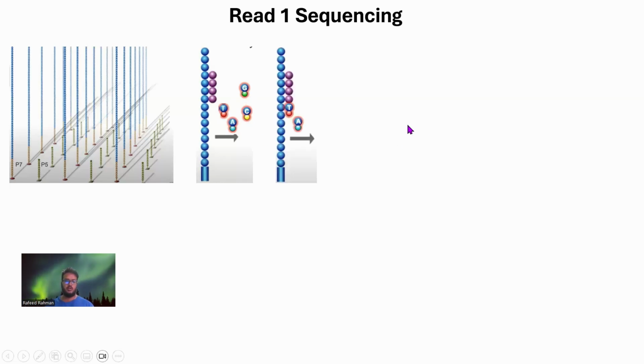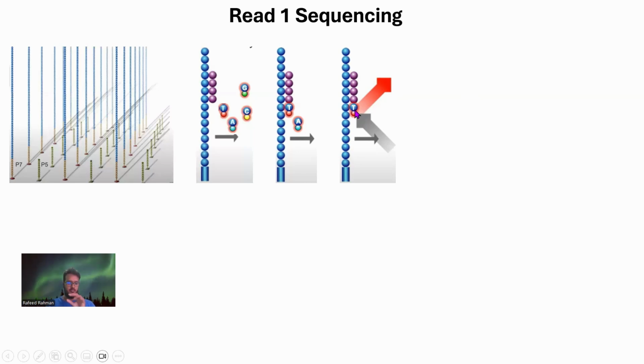So the DNA polymerase will start, and I'm just assuming here, maybe it's putting a T right here because maybe here you have an A. So the complementary of A is T, so it's putting it here. Then we judge what is the wavelength of this fluorescent molecule, and maybe it is similar to the red wavelength. So we deduce that it is red, or it is basically a synthesis of T. That means the main base is actually A, right? Now understand that this base that we just inferred, the synthesis is T and the base is A, is for only one strand of this one cluster.